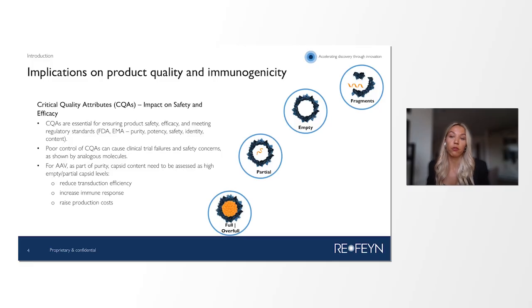If critical quality attributes are poorly controlled, they can cause failures in clinical trials and have potential safety concerns for the therapy.